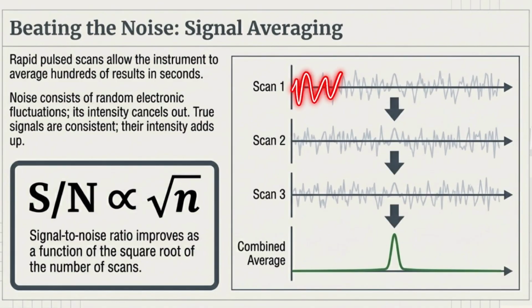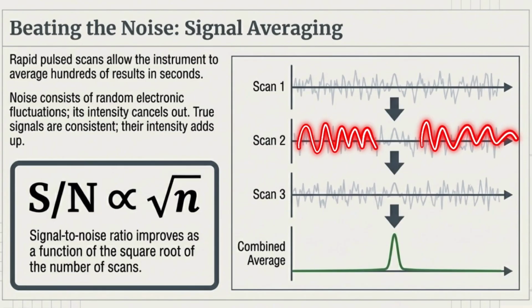All other peaks appearing in the spectrum are noise. So how does the system identify that a particular peak is not a genuine peak but noise? The noise signal always fluctuates above and below the baseline with equal strength. So the computer identifies these signals and ultimately cancels them.